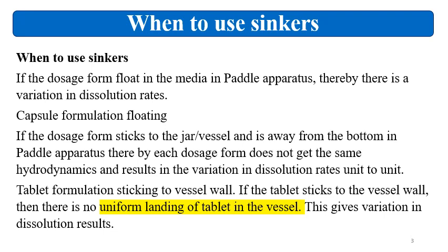Like some of the capsule formulation float into the dissolution bowl. If the dosage form stick to the jar vessel inside, and if it is away from the bottom, then also the formulation will show variation and the dissolution will not be reproducible.